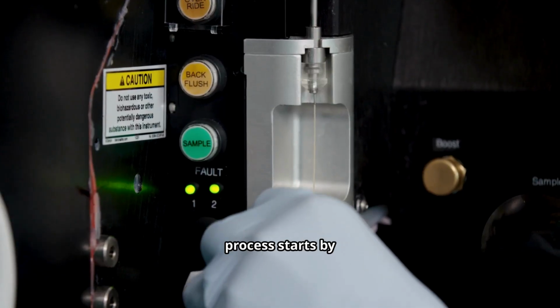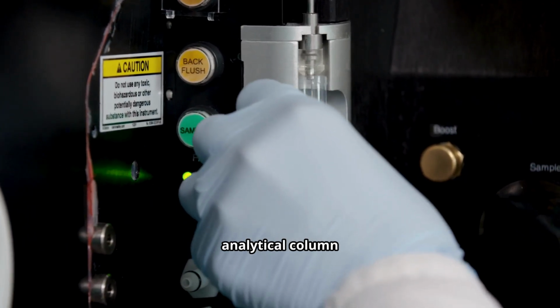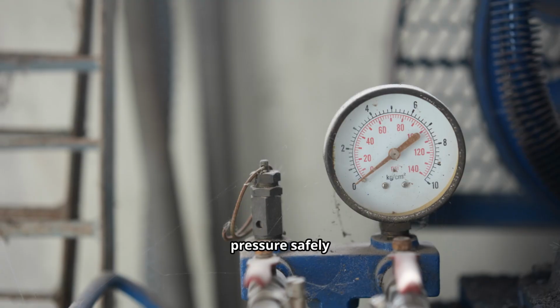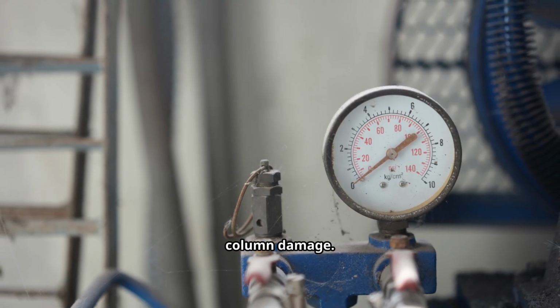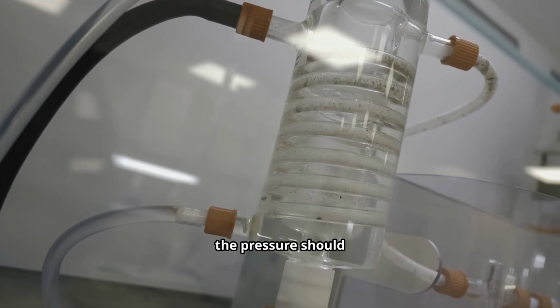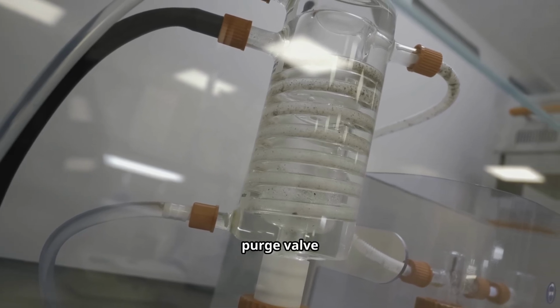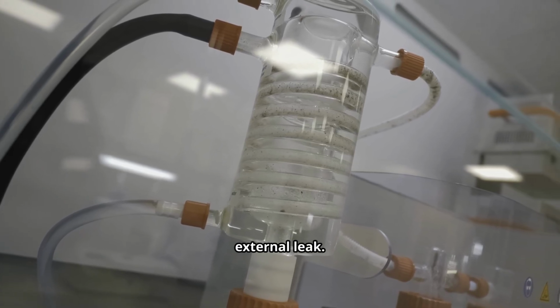The diagnostic process starts by removing the analytical column and installing a back pressure restrictor. This allows the pump to generate pressure safely without risking column damage. Under normal operation, the pressure should be stable with minimal ripple. Any visible solvent at fittings or the purge valve immediately indicates an external leak.